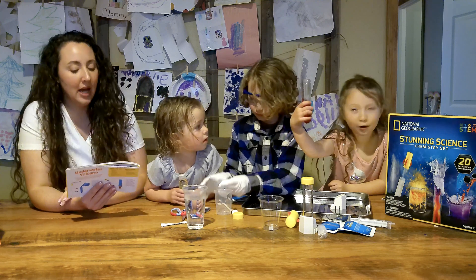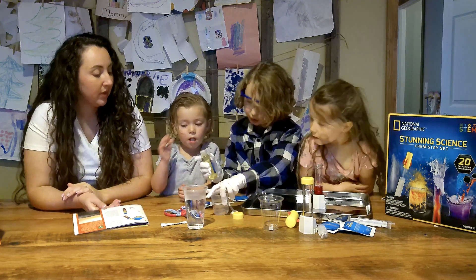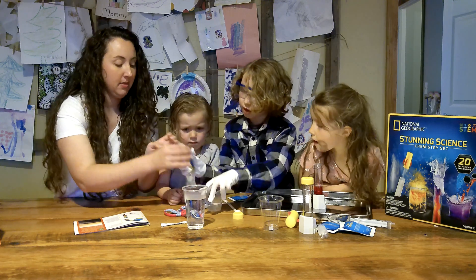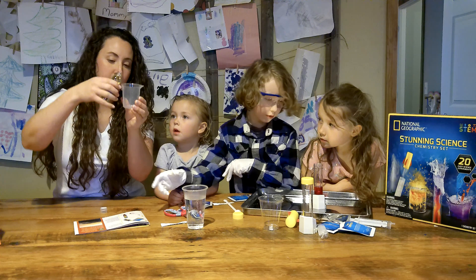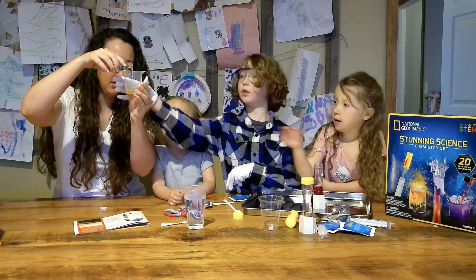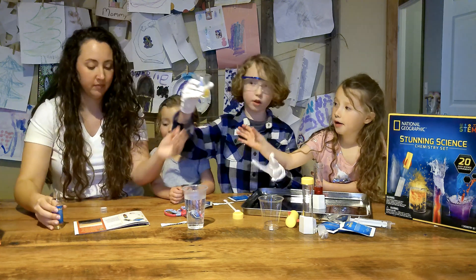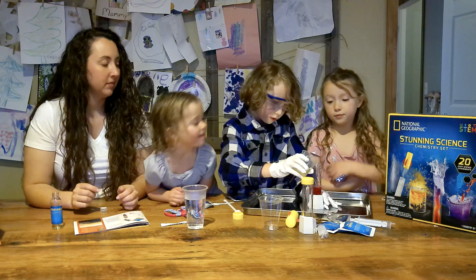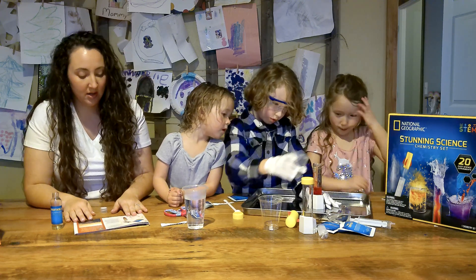Now we're going to add 30 milliliters of vegetable oil. 30 milliliters? Yes. I can do that for you. There we go. That's it? Yeah! That was a whole bunch.